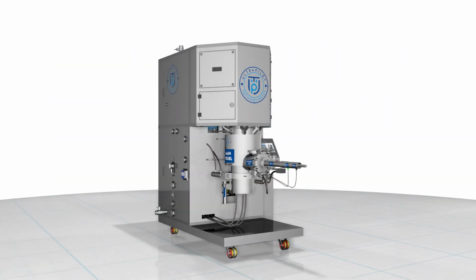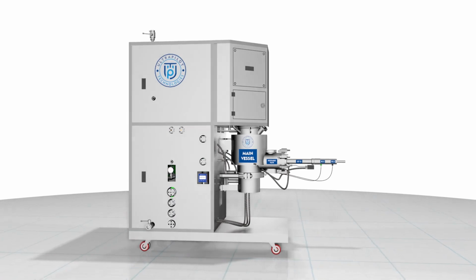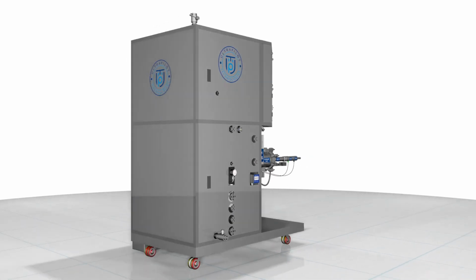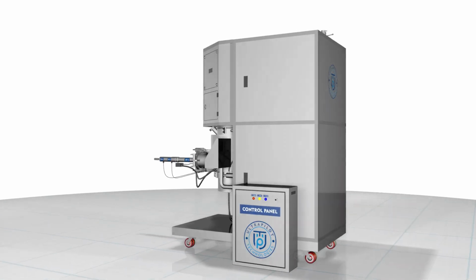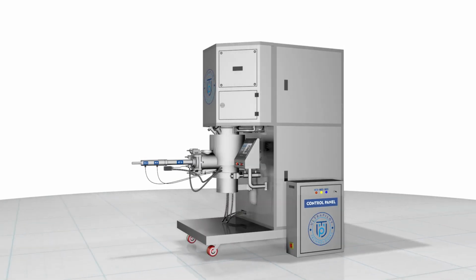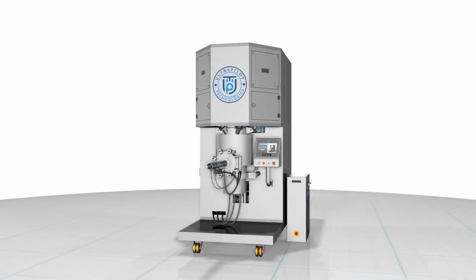The Agitated Nutsche Filter Dryer system is used for solid-liquid separation, washing solids for purity, drying solids by imparting indirect heat, and then discharging the dry solids by means of the specially designed agitator.